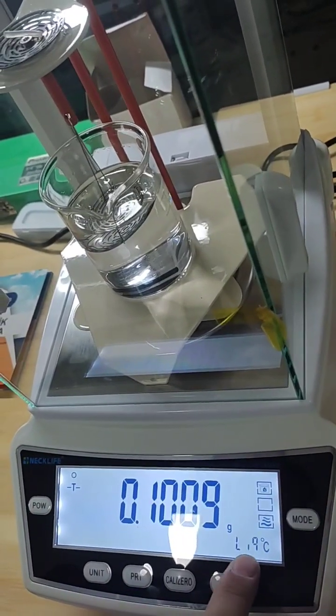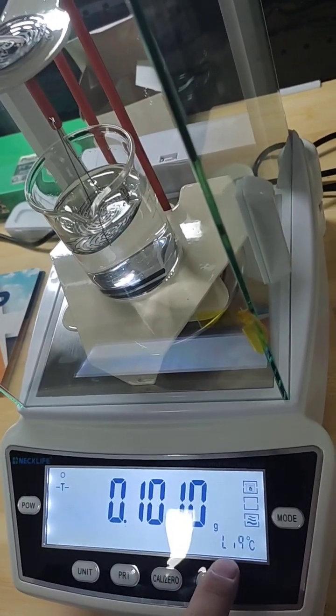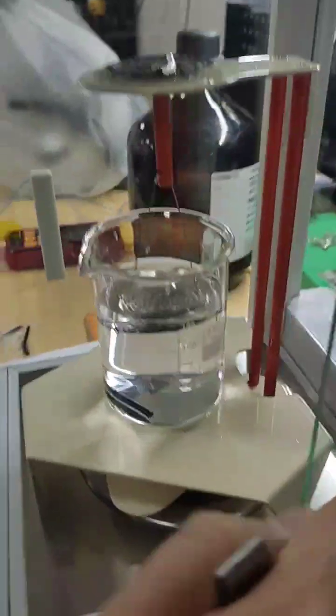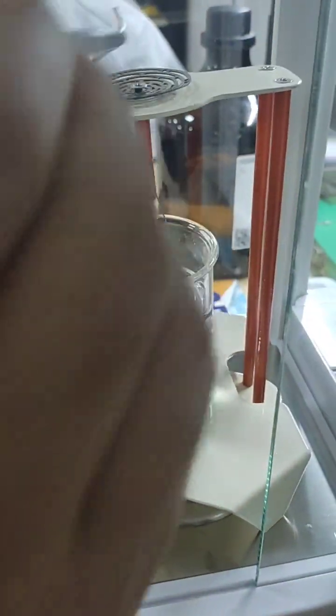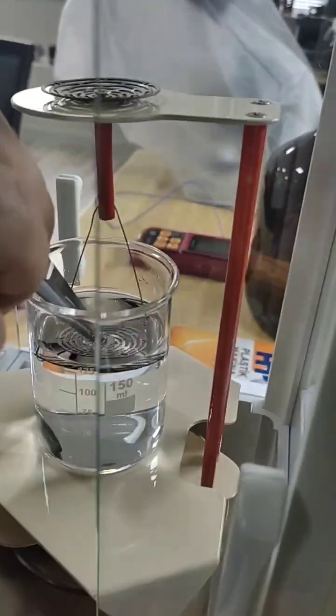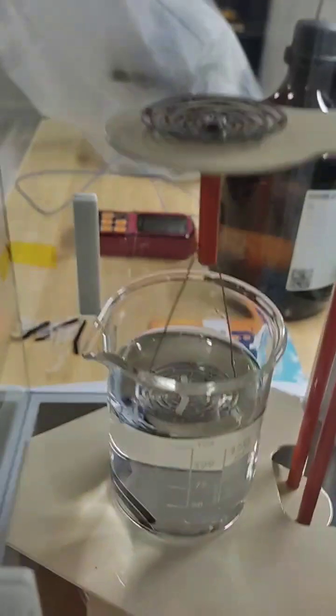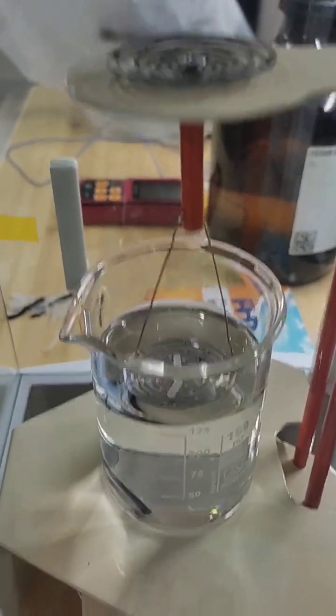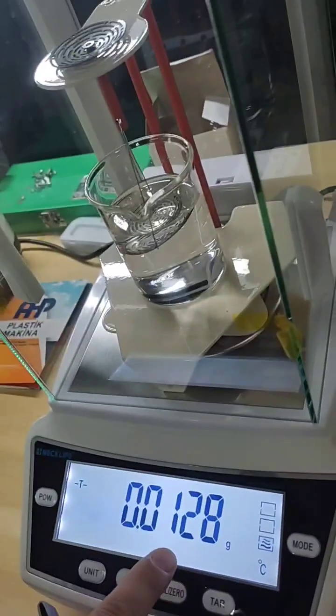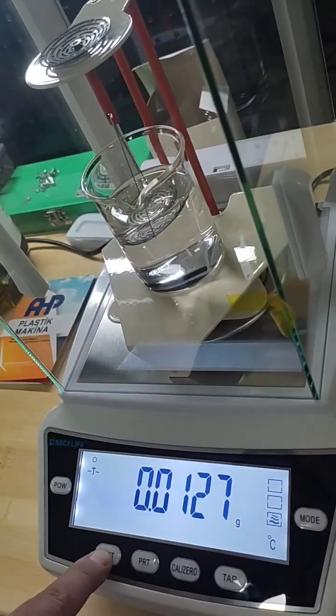Now it shows liquid blinking. LIQ is blinking here. Then you need to move the sample piece to liquid. Like this. After the digit is stabilized, you can click on unit.